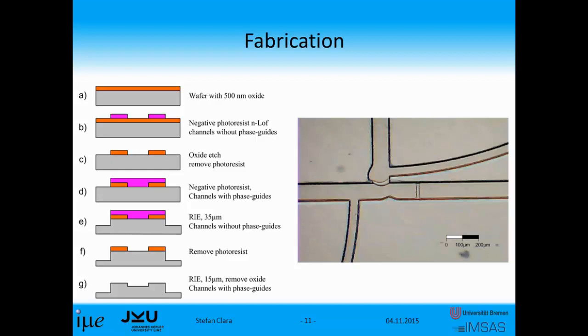The only thing I have to mention is that we had some problems. The initial plan was to manufacture everything in PDMS and then cover it with parylene so that the material is not air permeable anymore. But as always with these clean room processes, the machine you need the most is not working at the moment.